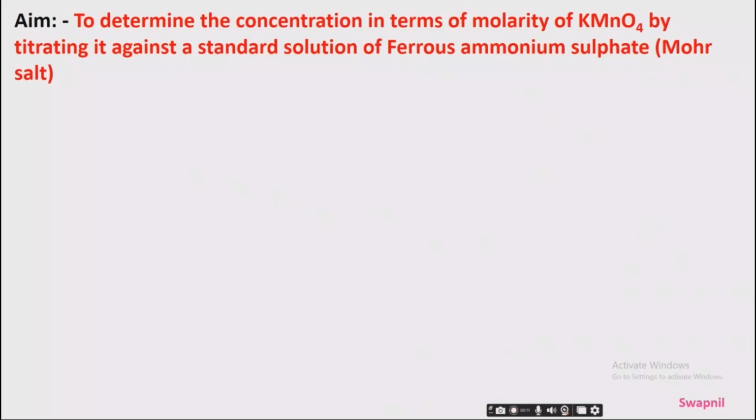So the aim is to determine the concentration of KMnO4 in terms of molarity by titrating it against a standard solution of ferrous ammonium sulfate, that is Mohr's salt.